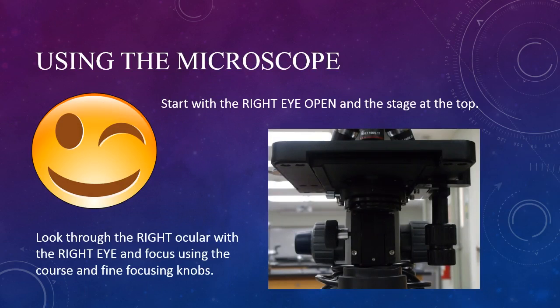Now let's address the clarity of the image. We need to bring our specimen into focus. We start by closing the left eye, and with the right eye open, look through the right ocular and focus the image with the coarse and fine focus knobs located at the bottom of the frame.